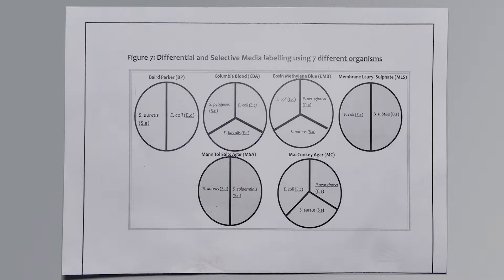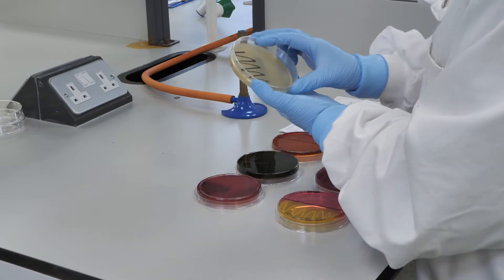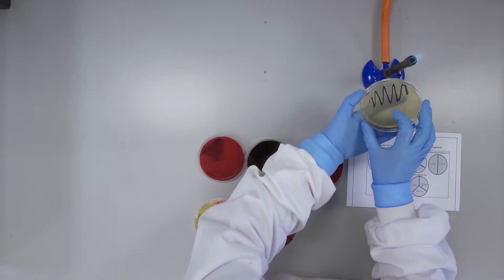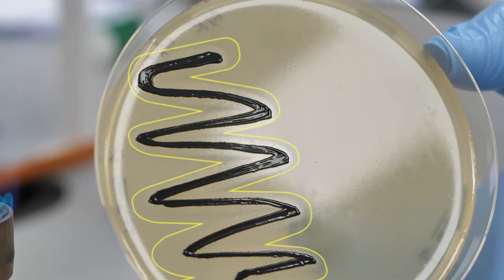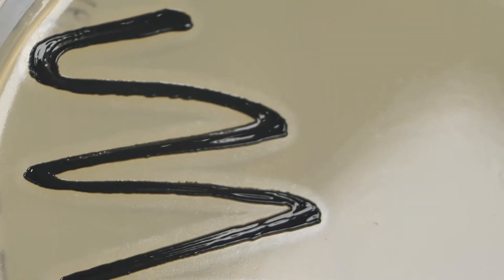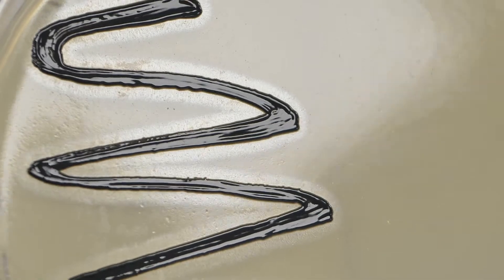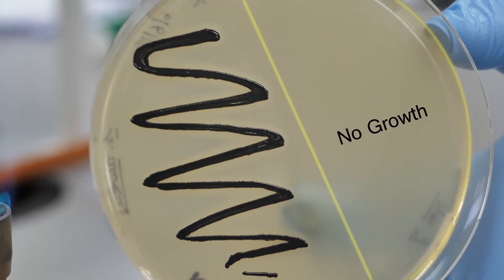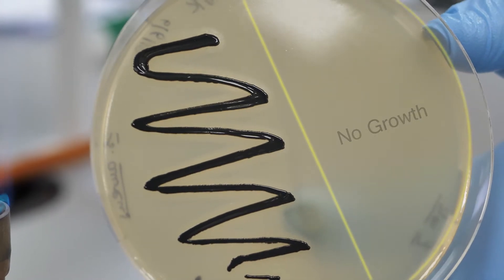On Baird Parker Agar, growth of coagulase positive Staphylococcus takes on a very distinctive black colour and the colony is surrounded by a clear zone. Coagulase negative colonies will have no clear zone. Note, when there is no growth on one side of the plate, the particular strain of bacteria has been inhibited.